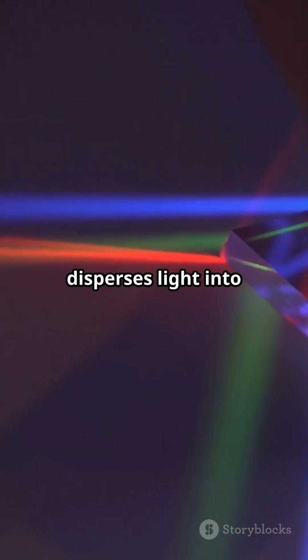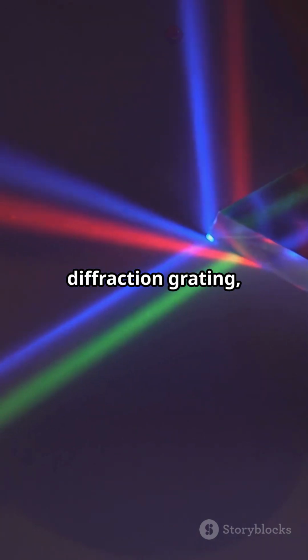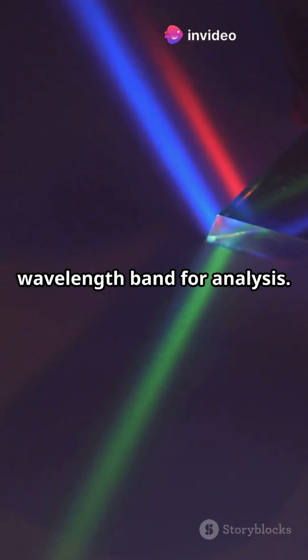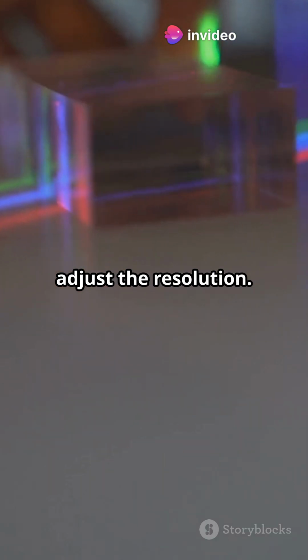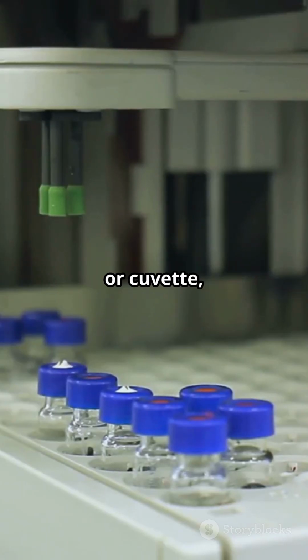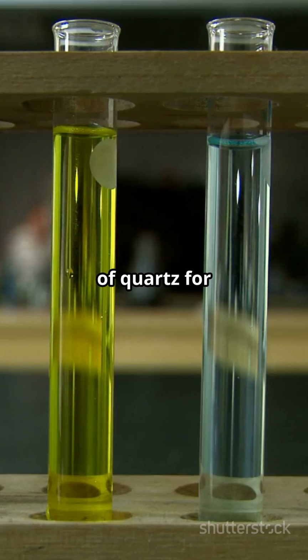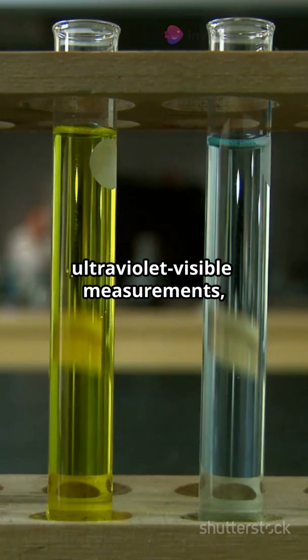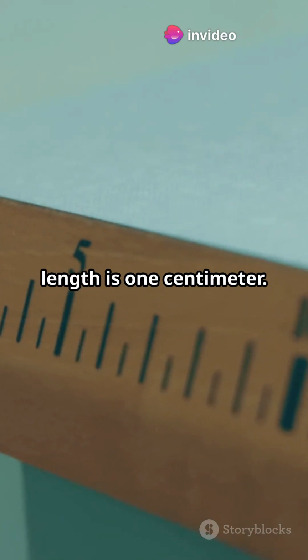The monochromator disperses light into specific wavelengths using a prism or diffraction grating, allowing selection of a narrow wavelength band for analysis. The slit in the monochromator can adjust the resolution. The sample holder, or cuvette, holds the sample in the light path. It is typically made of quartz for ultraviolet visible measurements or glass and plastic for visible light. The standard path length is 1 centimeter.